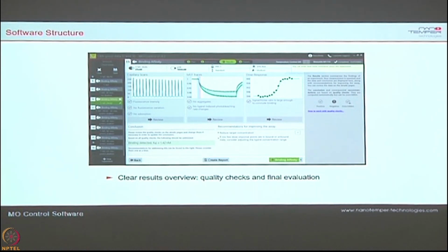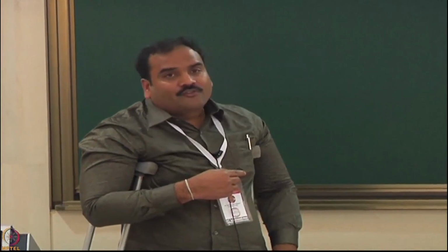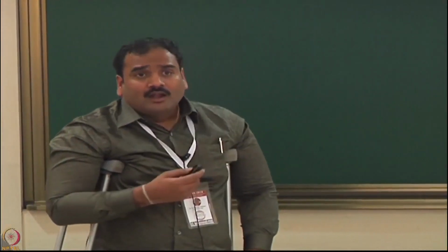Of course, as a user we always know technically what is happening. By looking at the data we can always assess, but still the software will help you make a judgment on your analysis, and you always get all the data on a single page. As you see here, this is a clean binding fit. And these are all the thermophoretic traces of all the dilutions you have made.